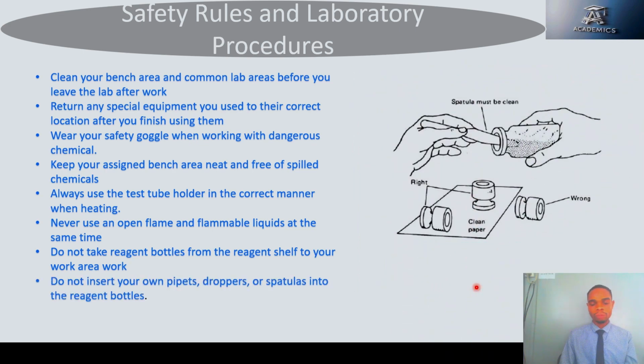Never dip one chemical into another. In fact, never dip a glass straw directly into the original chemical. It might contaminate it. Instead, use a beaker to collect the amount you need and return the original bottle.